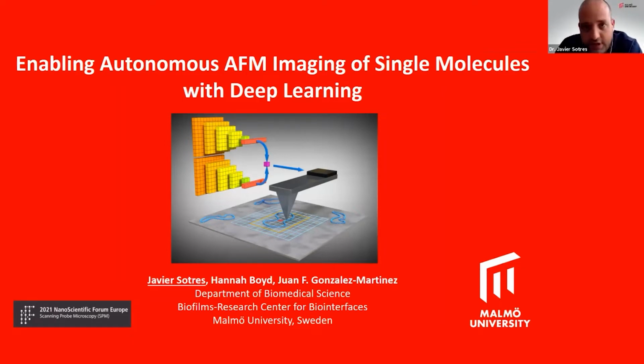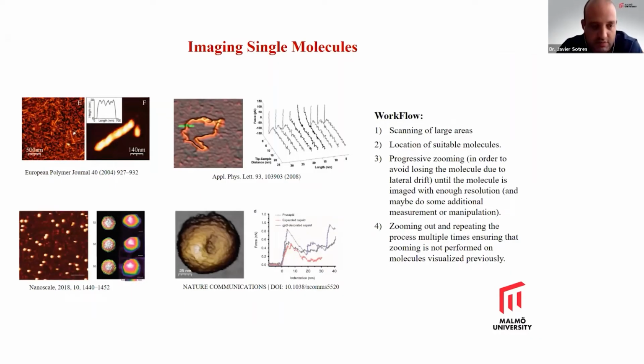But you can do a lot of things with an AFM, so if we are talking about automation, we have to focus on each type of experiment, and the one that we have focused on in this work was imaging single molecules.